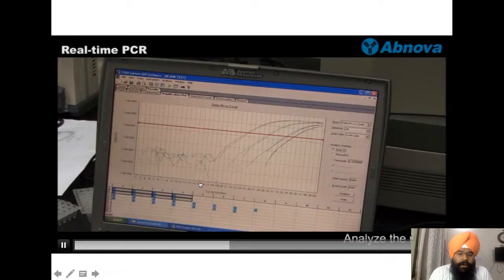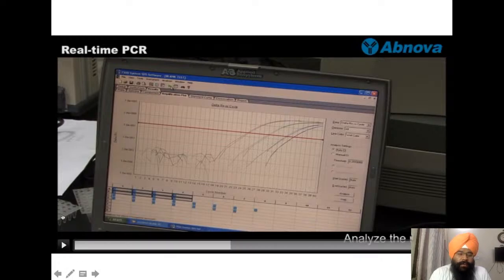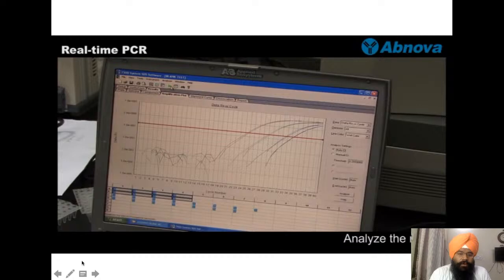Sorry students, I will not be taking care of the analysis part. Please go through it on your own. I will just be sharing with you today the techniques, what is the basic principle behind it, and how you actually do it. To know about its calculations and how it is done in a detailed manner, if you go to any lab, they have their specific protocols for doing so. So don't worry much now that you don't have the protocol to do the RT-PCR and analyze the data.